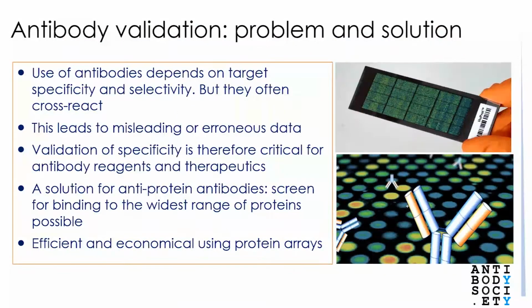As related throughout this webinar series, the quality of antibody reagents is recognized as vital to getting correct and reproducible results. Validation of antibodies or other protein binders is therefore a problem of utmost concern for all those who are using antibodies as research and diagnostic reagents. This centers around the frequent reports that many research antibodies against proteins fail to do their job, either by cross-reacting with a different protein or even not recognizing the desired target at all. This has caused several instances of misleading or erroneous data entering the literature, especially with techniques like Western blot or immunohistochemistry.